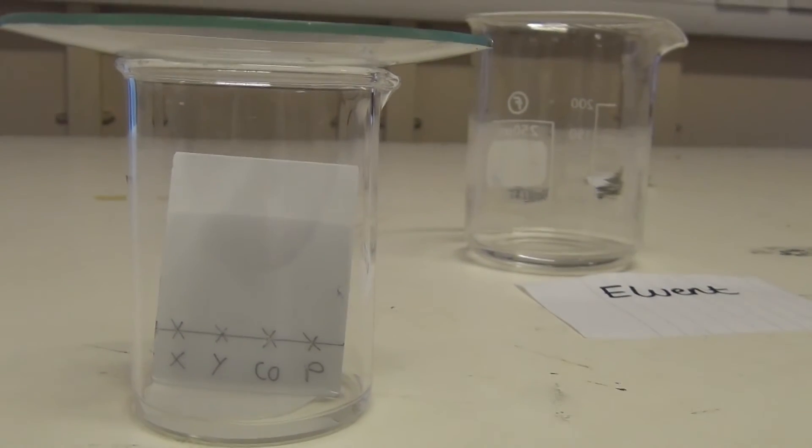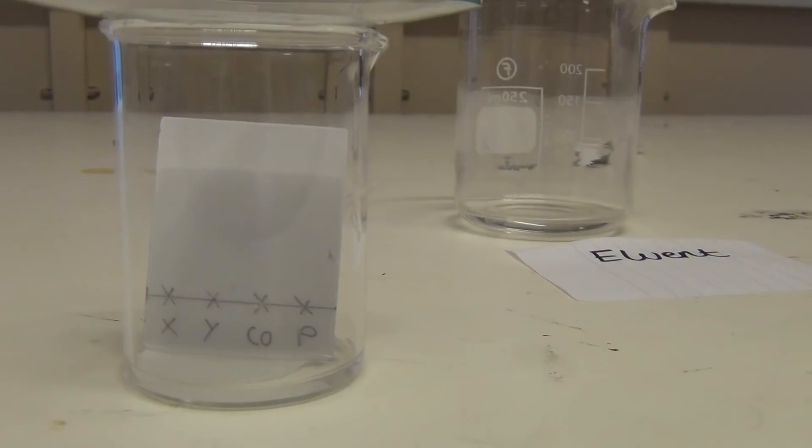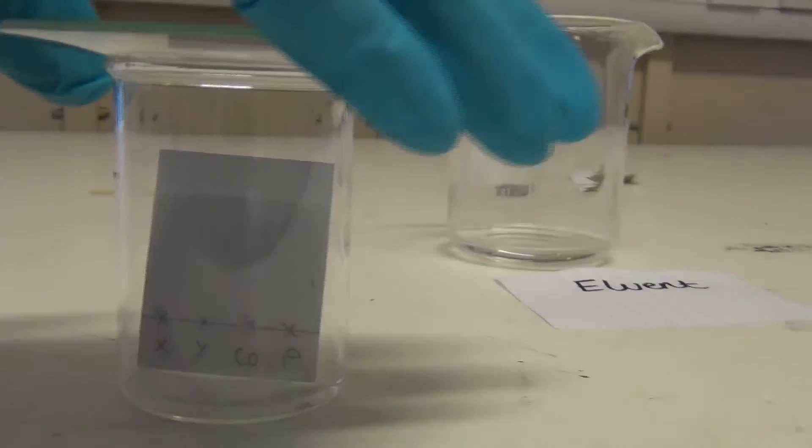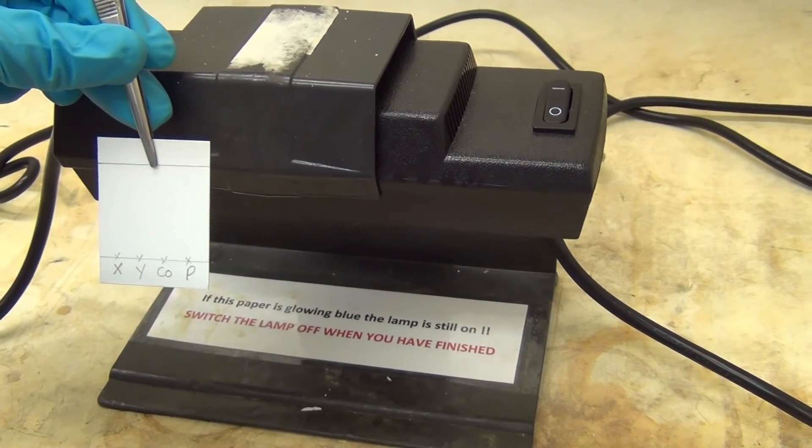Allow the eluent to run up the plate to within around 0.5cm from the top of the plate, and then remove the plate from the chamber using tweezers. Then quickly draw a line marking where the eluent ran up to. This is known as the solvent front, and remember to use pencil.